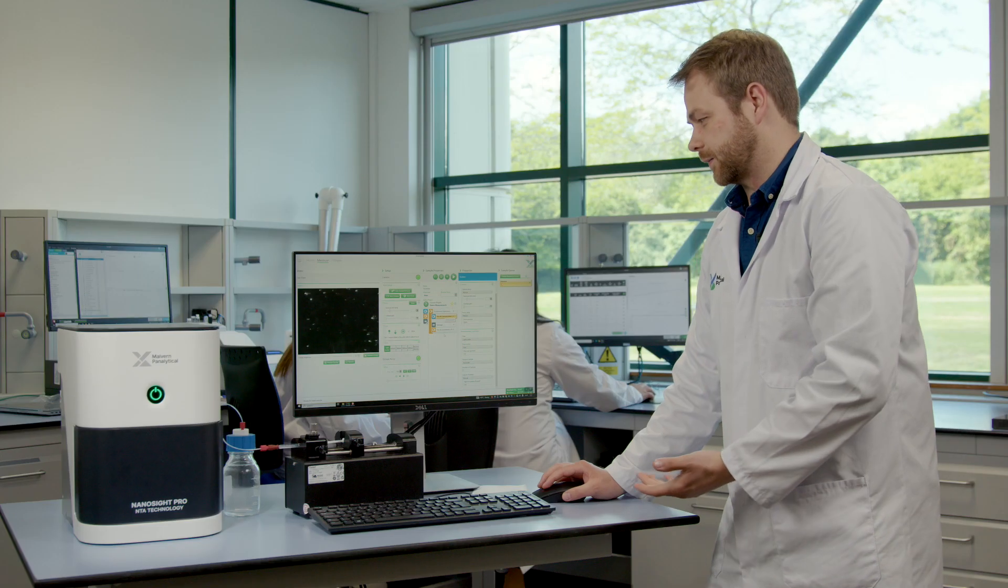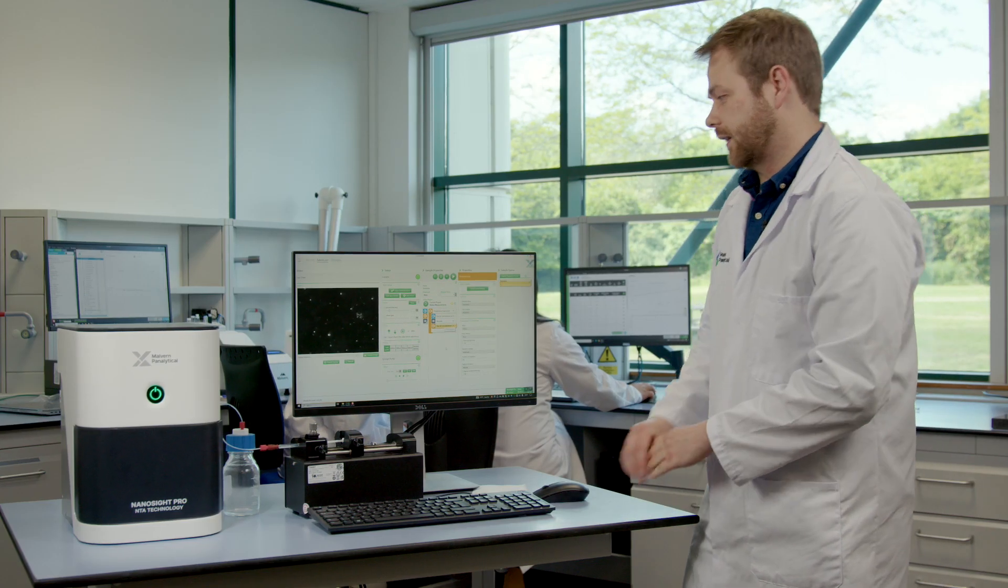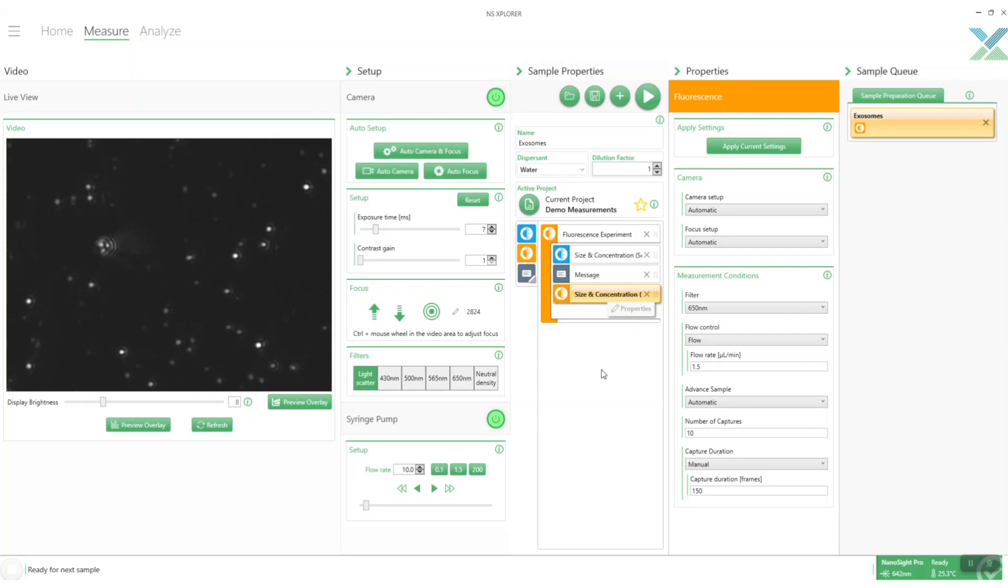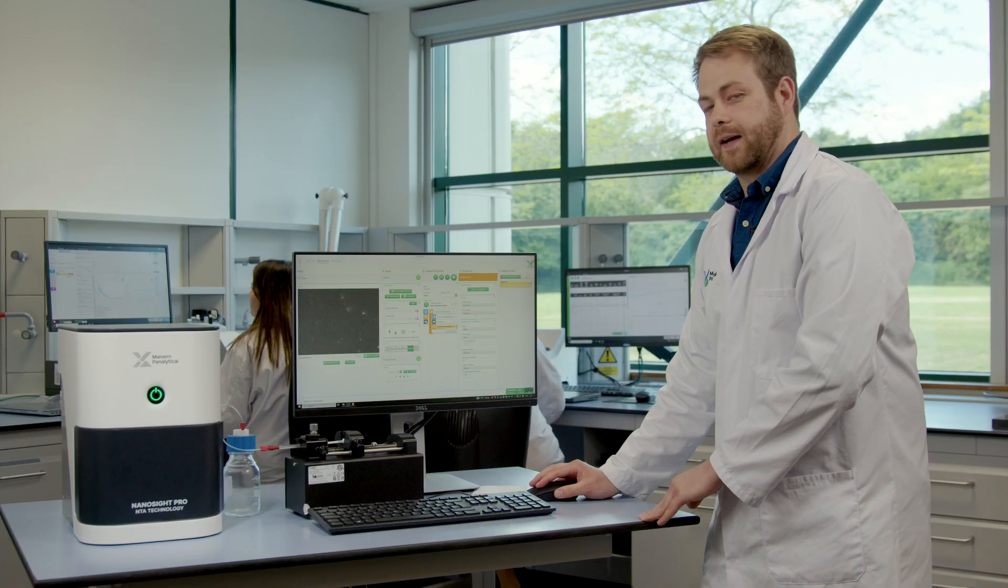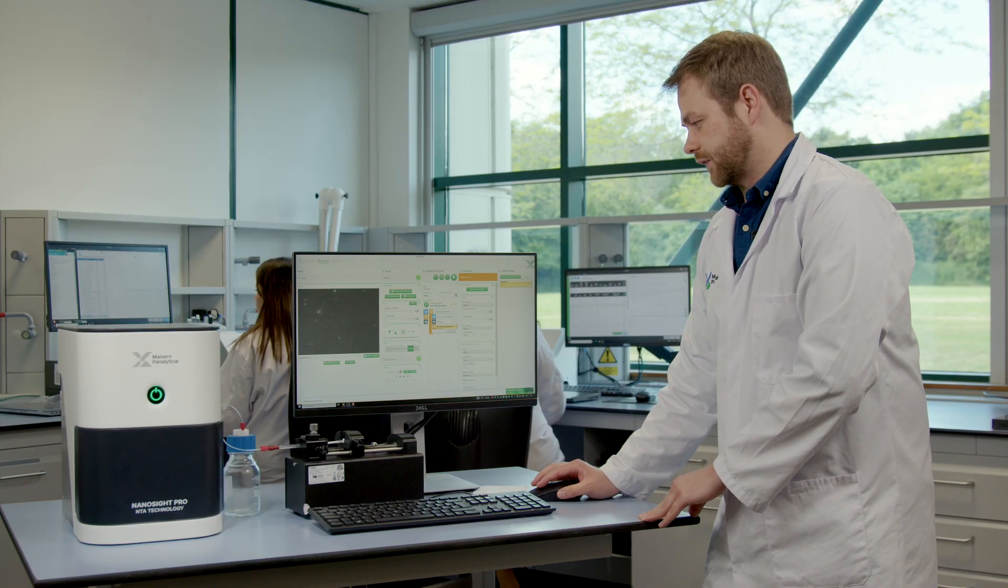The fluorescence part which we've not actually shown how you can do that yet I'm just going to show now. We can first apply our filter, you can see now you can't see the particles but when I increase the exposure and contrast to make it brighter you should start to see them come through here. I might just make the screen a little bit brighter as well to help see them better. Now that we're happy with those settings we can again click apply current settings puts them all in here.